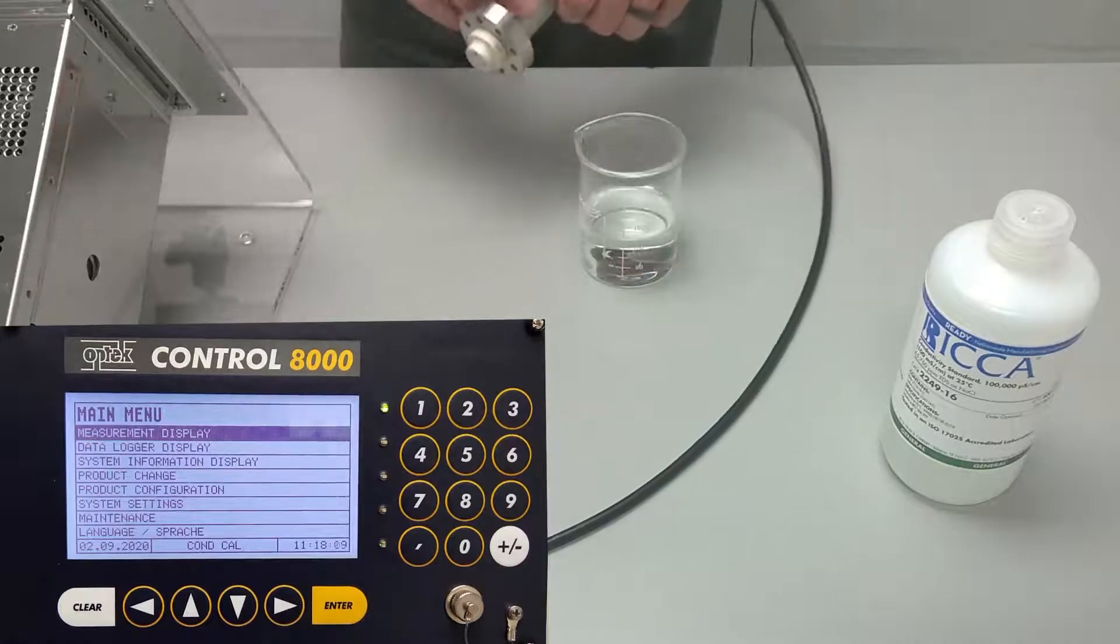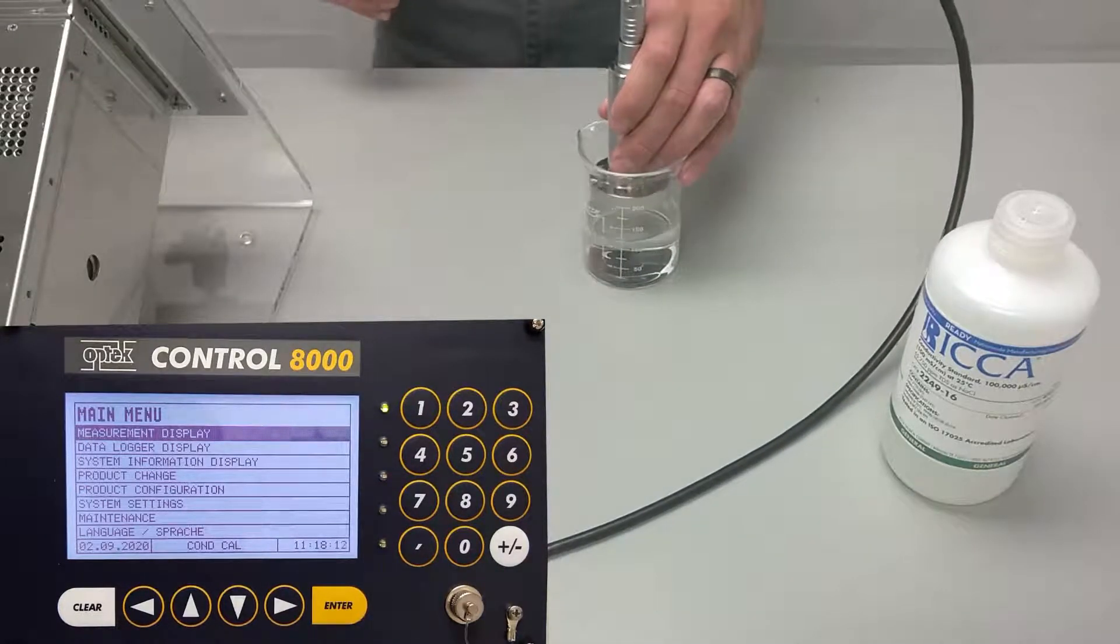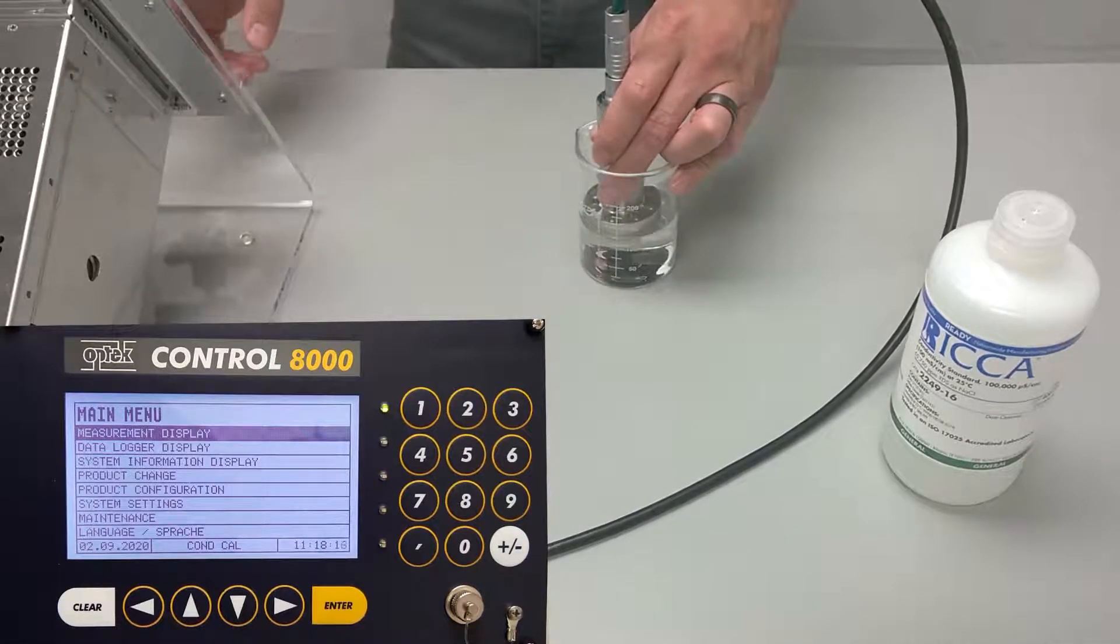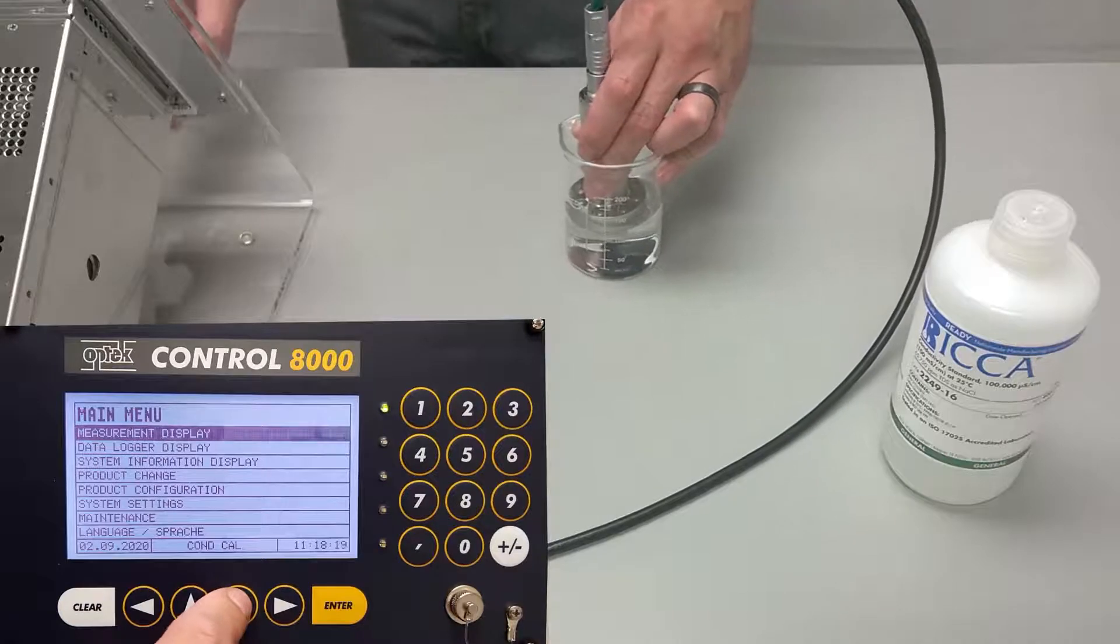Now we'll start the calibration portion. Introduce the conductivity sensor to the solution and ensure there is at least an inch of space between the bottom of the beaker and the probe to avoid wall effects.